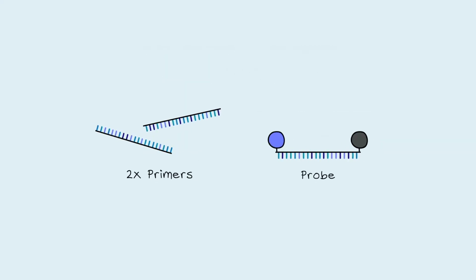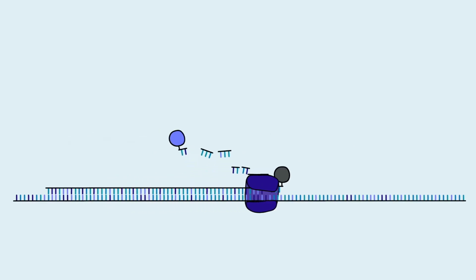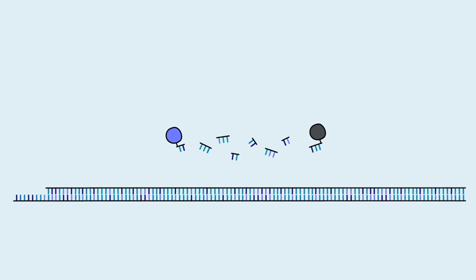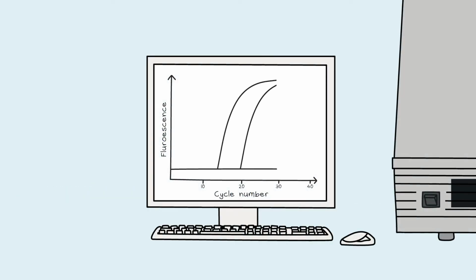To ensure that our genetic circuits had effectively converted the iPSCs to macrophages and neurons, we analyzed the cell's expression with qPCR. qPCR allowed us to obtain real-time data that proved that certain genes associated with our desired cell types were turned on in the cell.